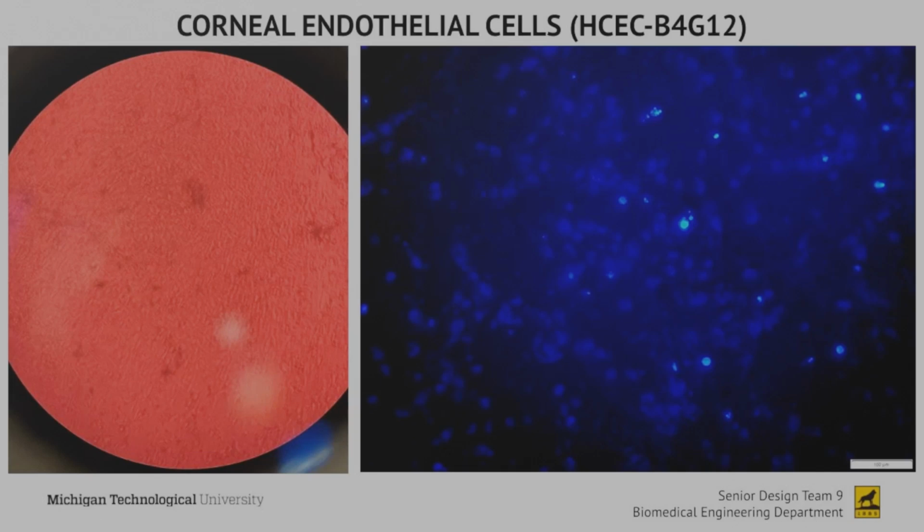As with any living thing, our body is made up of cells. The forces between these cells, or cell junctions, are crucial to keeping our tissue intact. Cell monolayers, while only being one cell thick, not only act as the physical barrier between internal and external environments within the body, but must also withstand a large amount of mechanical stress.